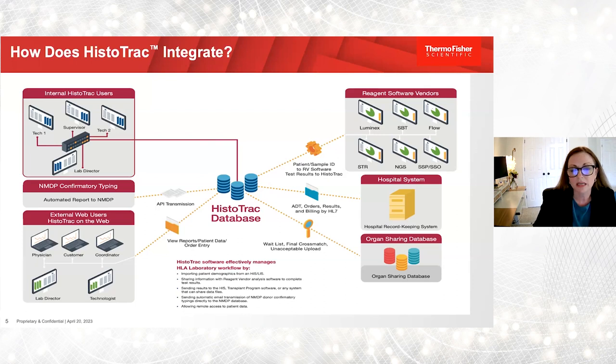We have folks that need HistoTrac on the web for their external clients. So if you have coordinators, if you're tired of getting a phone call in the middle of the night saying what's the most current serum sample on a patient, folks that have HistoTrac on the web would allow their clinicians to log in and have access to pieces and parts of HistoTrac that the lab has given them access to. So if you're familiar with the customized view term in HistoTrac, you're essentially customizing the view for those clinicians, so they don't get to see everything unless you've given them that permission.